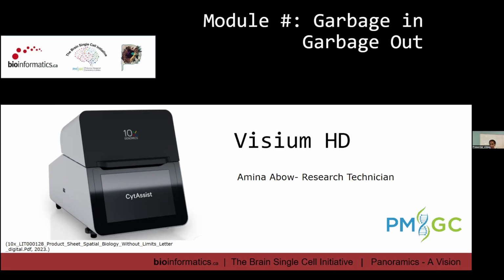Thank you. Hi, everyone. My name is Amina. I'm a research technician at the Princess Margaret Genomics Center. I work on the spatial transcriptomics team, specifically on Visium HD and Visium V2. And today I'll be talking about the sample processing portion of Visium HD.